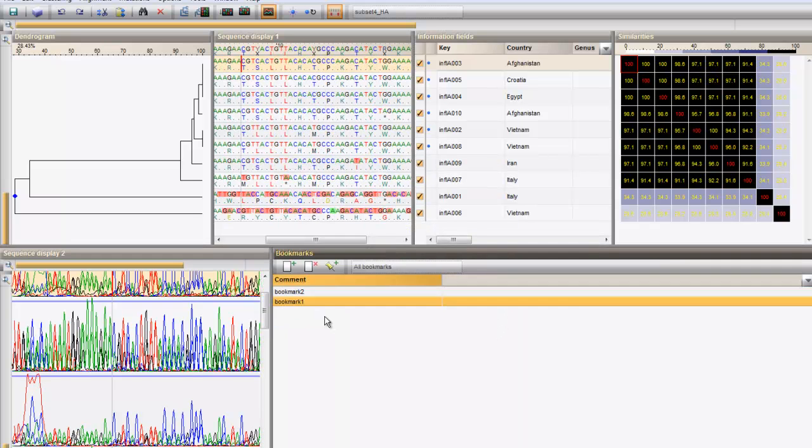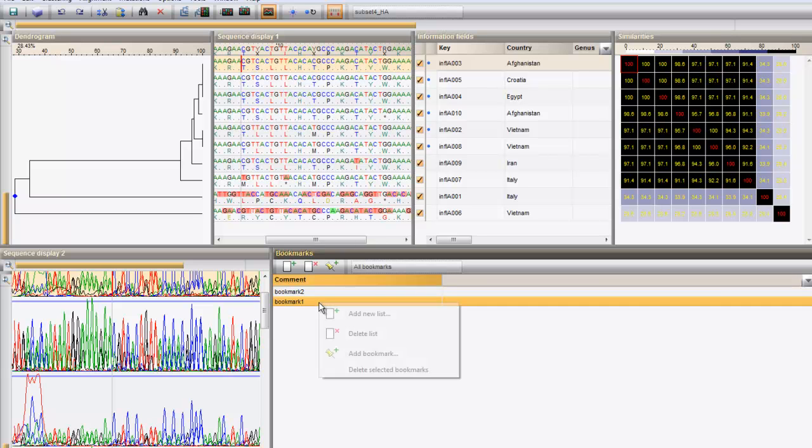To delete a bookmark, right-click on the bookmark and select Delete selected bookmarks.